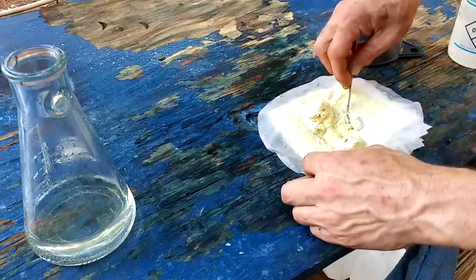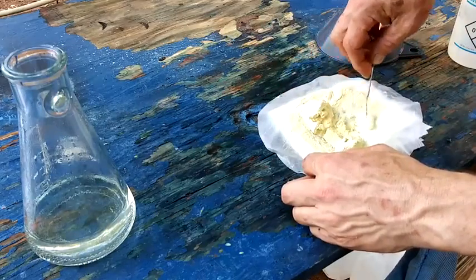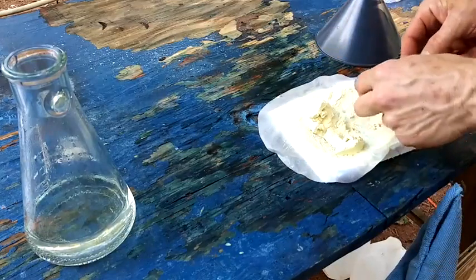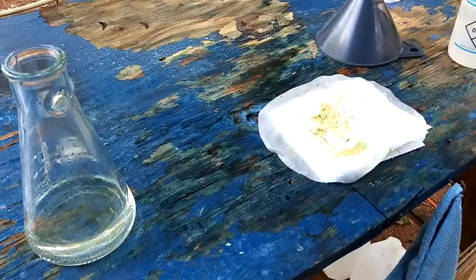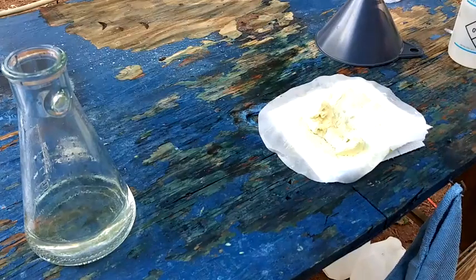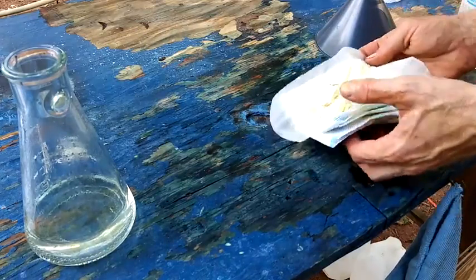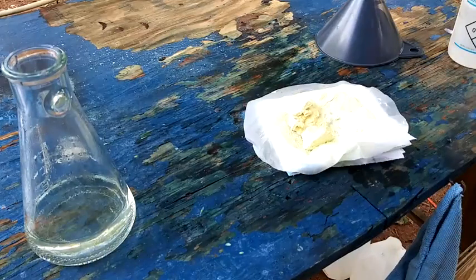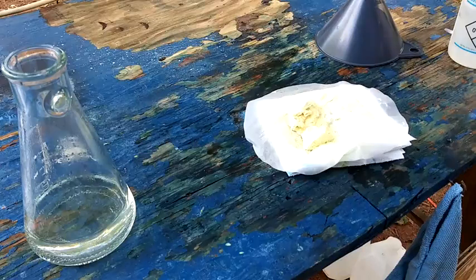Come on, Stirrer. There you go, buddy. Alright, so it doesn't take very long for this to soak all the way through, especially on the first one. So I'm going to go ahead and do a second one now. Suck even more water out of it.